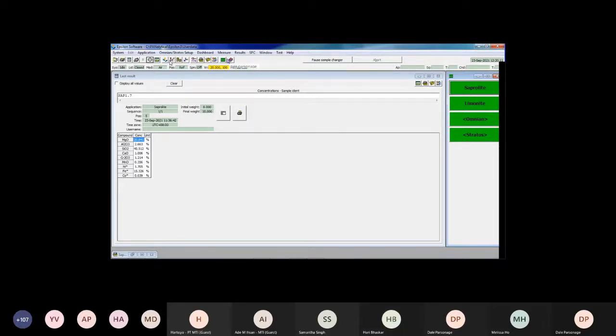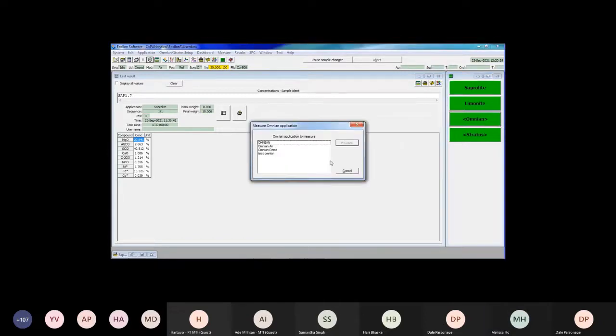The Omnian is what we call a standardless program, because the standards are a fundamental calibration. It is an additional module and license, and it's operated through the dashboard in terms of its setup, but it still measures from within the normal software, which means the analysis is right at your fingertips. I actually have my Omnian set up to run in both helium and air environments, which gives flexibility for customers that might not opt for the optional helium, but you can run the Omnian both with and without.